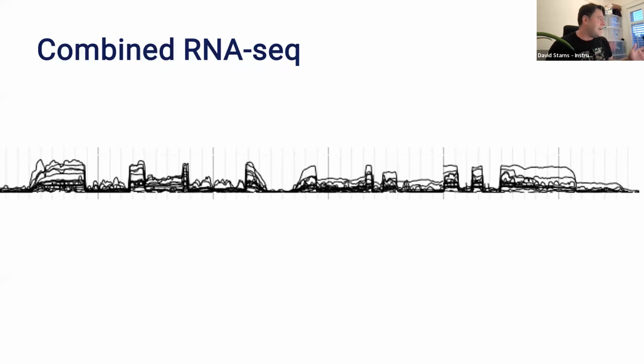As you can see in this gene, where you have a grainy background, this can indicate where transcripts have actually been extended over 2 exons. So it's not 2 exons, it's just one big exon in certain transcripts. So it's kind of fuzziness. And of course, these peaks obviously are indicative of just major exons. So you have this coverage, which is very nice.